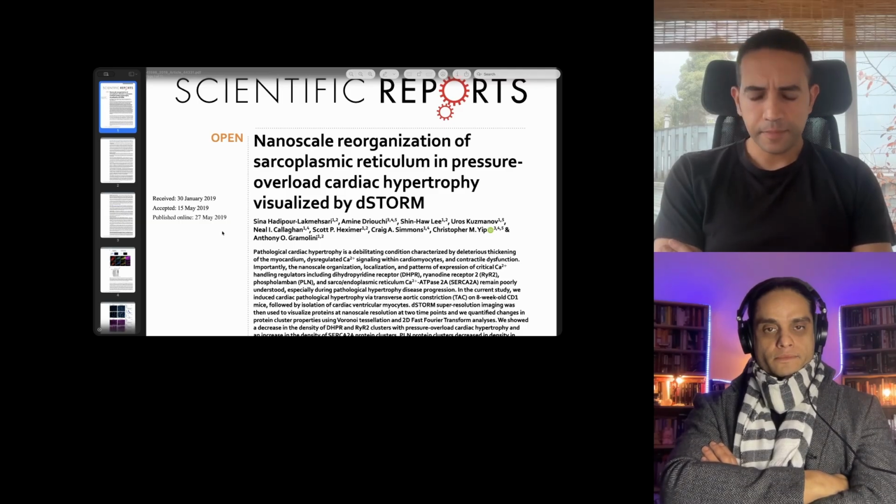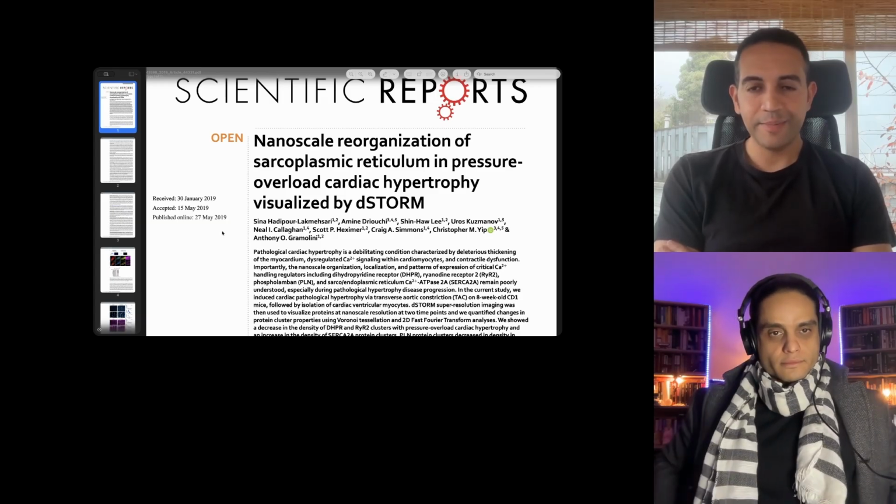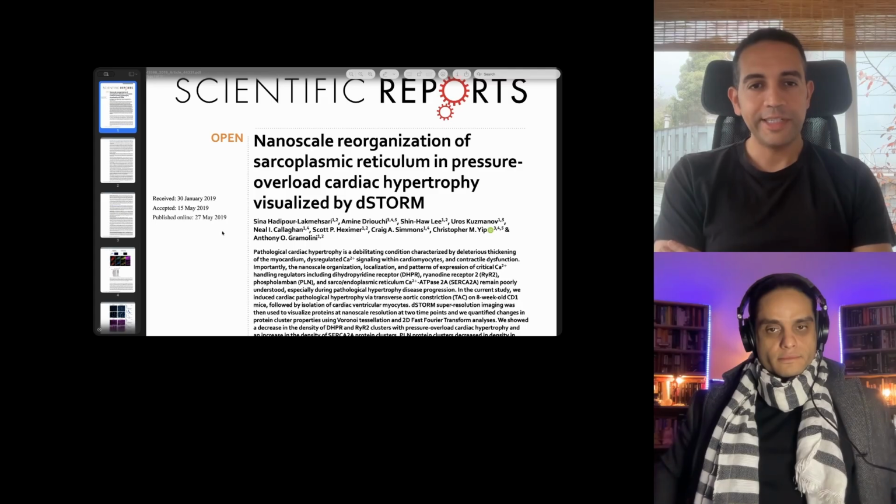In this case, you're using organic fluorophores. The usual suspect was Alexa Fluor 647, used in most of those early papers.